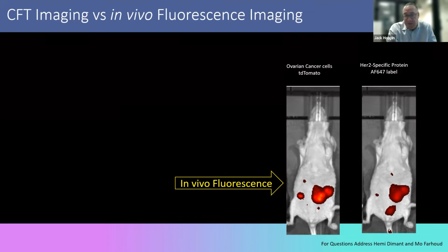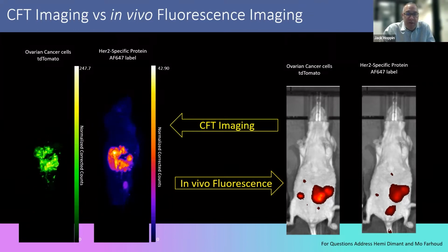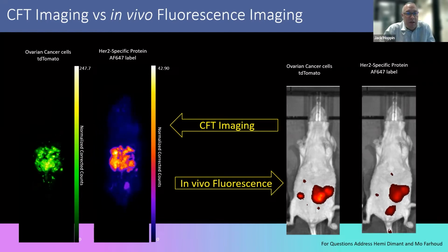You definitely know there's tumor activity and probe activity and compound activity in the center of the mouse, but it's just, again, wildly informative to look at what's really happened and co-localize the cells with the imaging agents. I'll talk more in the major example of downstream processing. I just wanted to show off literally the highest level power of doing this technique.